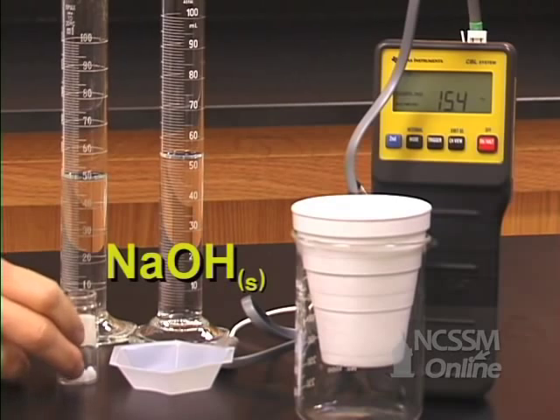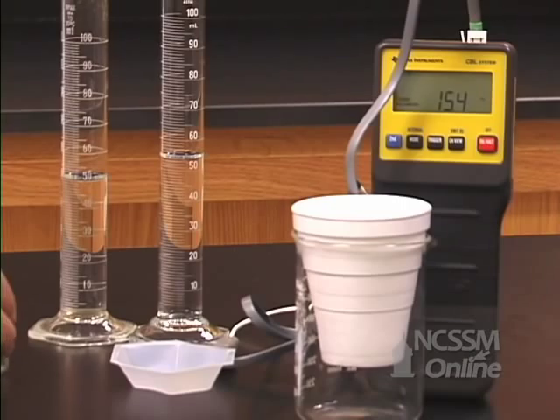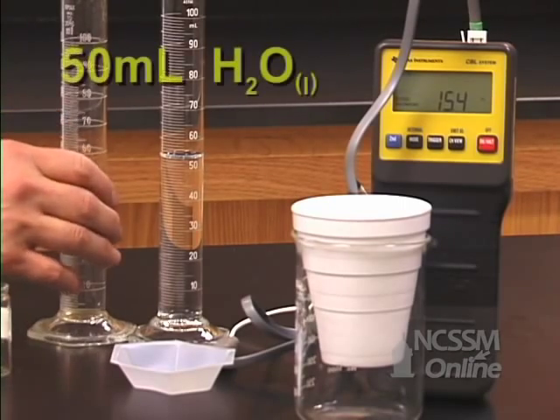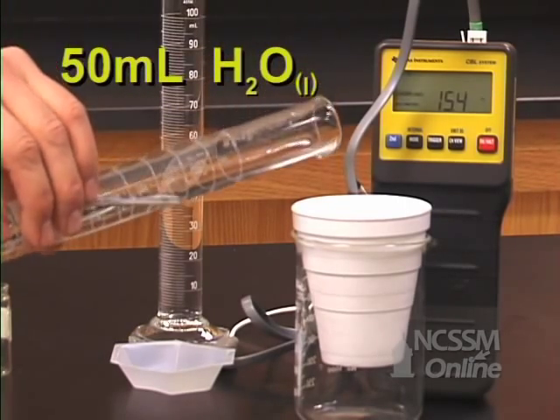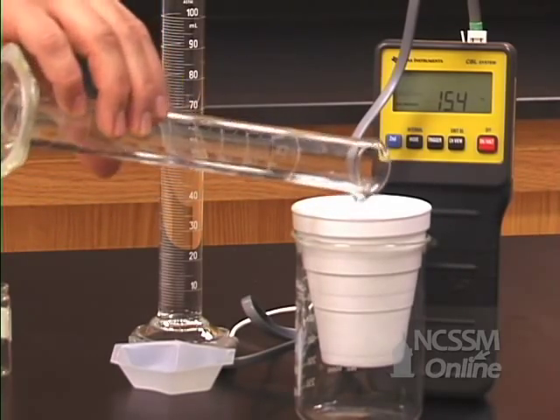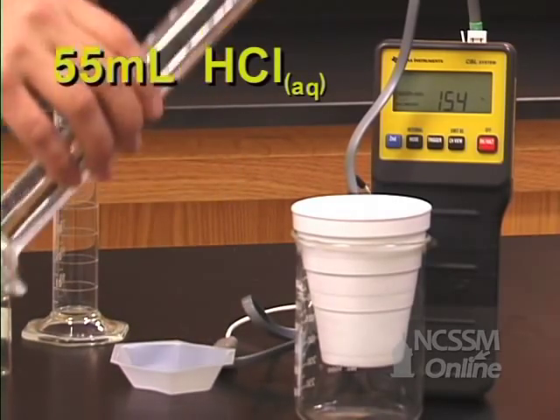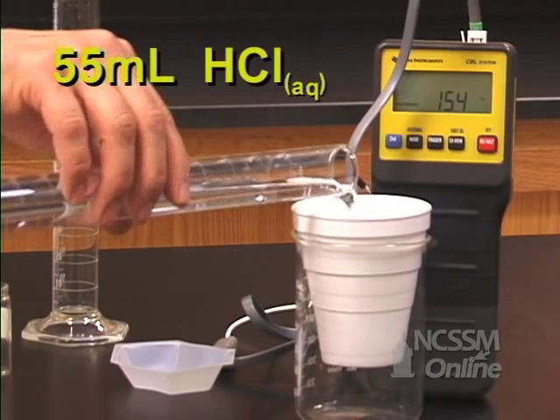We mass out about a one gram sample of solid sodium hydroxide. In our calorimeter, we add 50 mL of water and 55 mL of the hydrochloric acid solution.